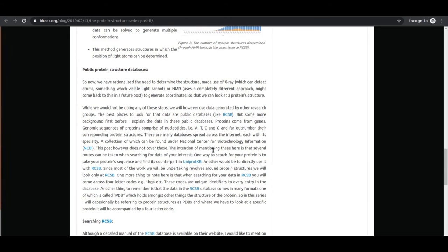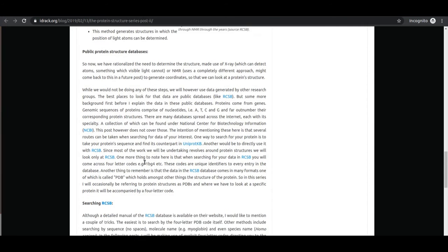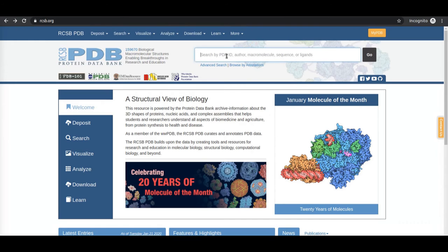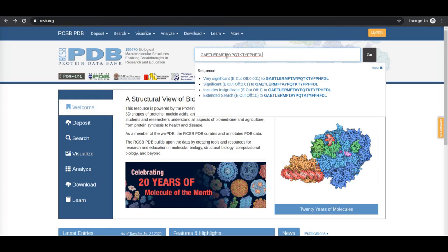Once protein structures are determined, the author packages the data into a PDB format file and uploads it to a structural database called RCSB. I show an example of the RCSB website — you can search in multiple ways. For example, if you have an amino acid sequence and want to find what kinds of proteins contain it, you can paste a short fragment and select a criteria such as an E-value cutoff. The E-value cutoff tells you how significant a match is — the smaller the cutoff, the higher the significance.